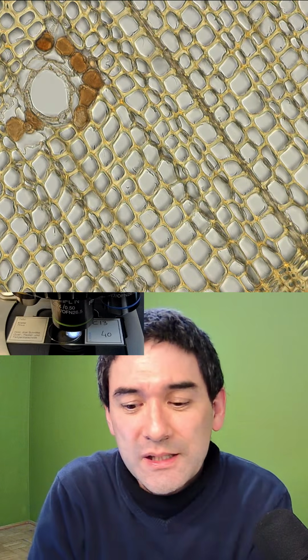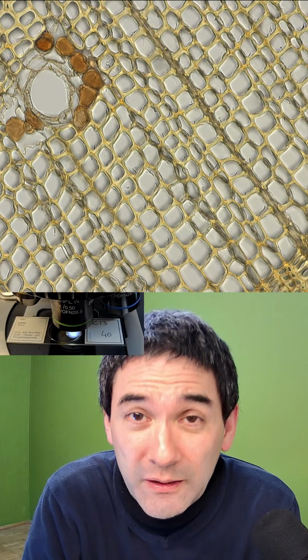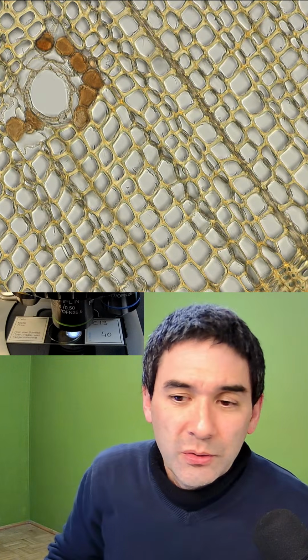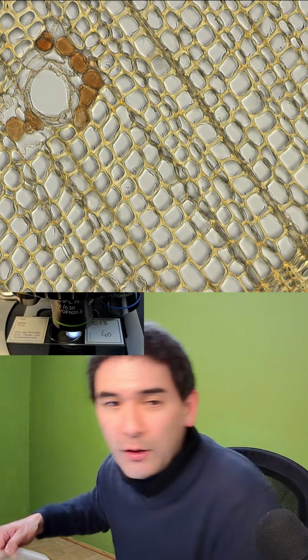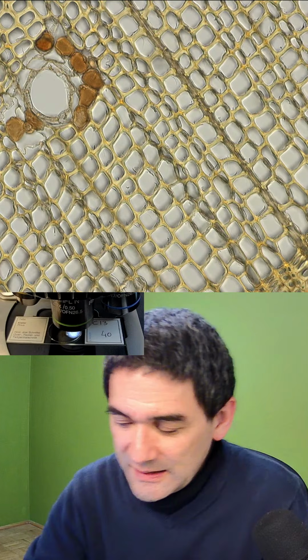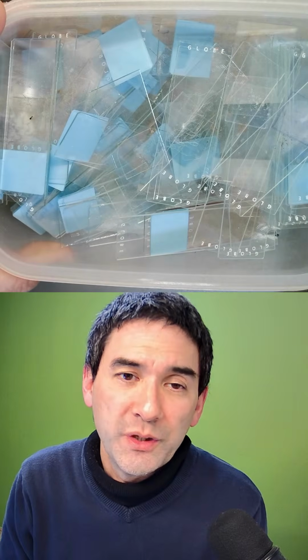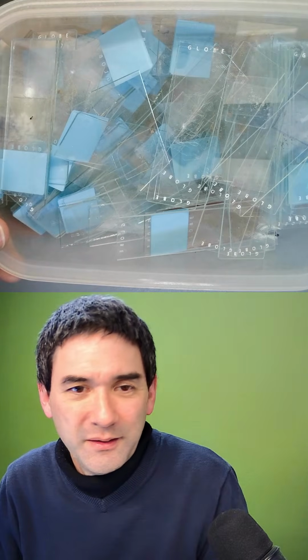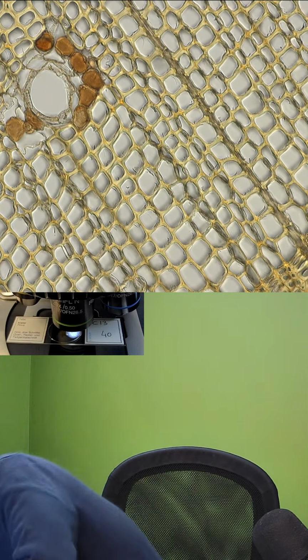Usually, what I do is I make, of course, a lot of slides, and then I film them or take pictures, and these are just temporary slides, and then I simply wash them. What I usually do is the following. Just a second. I always dump the slides into a plastic box like this, right? And then I wash them. I pour hot water over it, and then I wash each one individually, right? So I'm reusing those. That's basically how I do most of my microscopy work. Put this away.